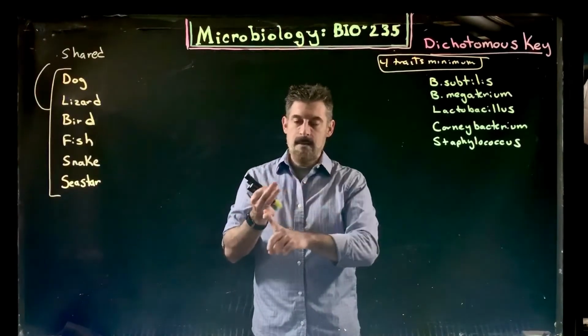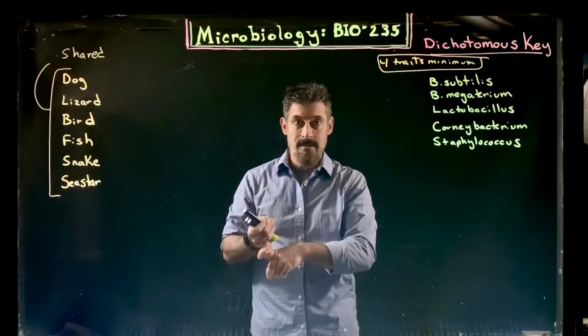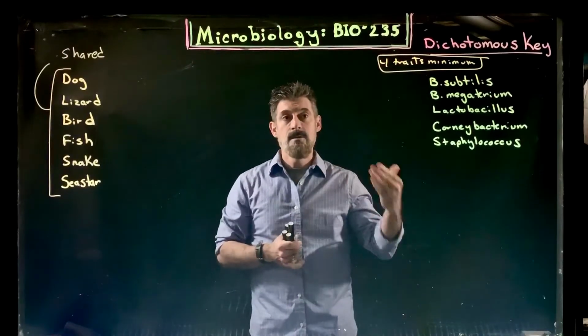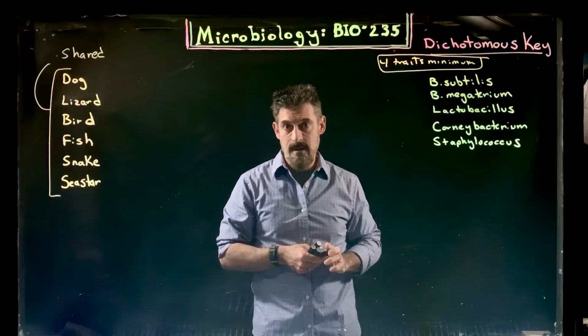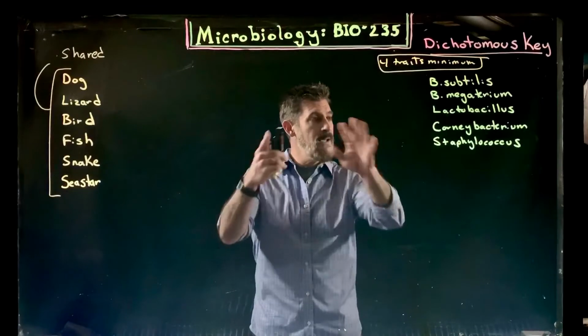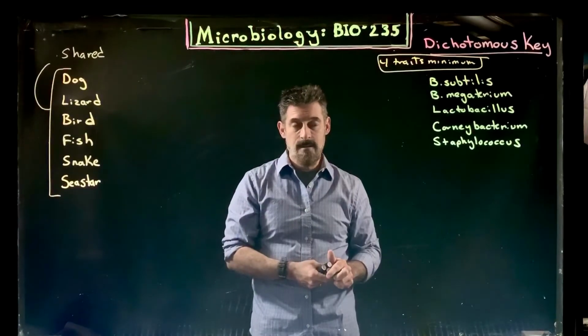So your lab had media, and what were all the types of media, their ingredients, what were the different tests, what were the test results. Then you have bacteria, characteristics. How do they grow with that media? What kind of results do they have for a particular test? That was part 2. Part 3 now is making a dichotomous key. So you're going to make a key on how you would identify organisms based on some of those characteristics or traits.